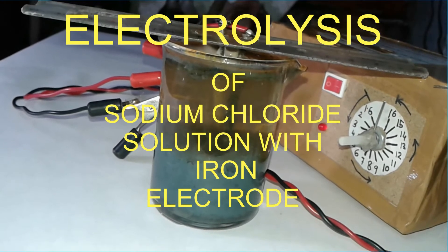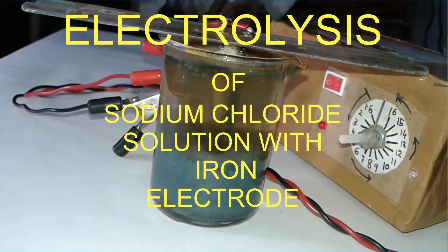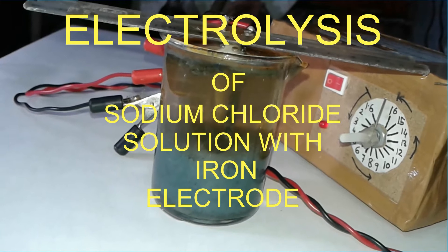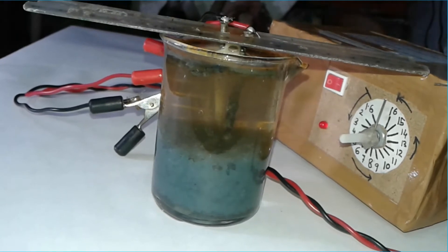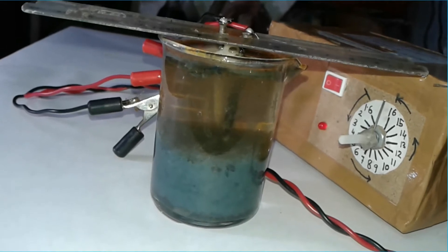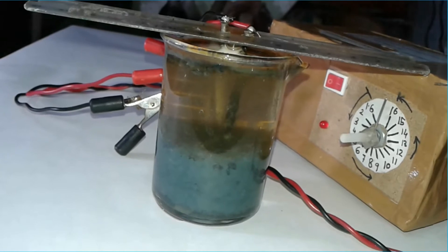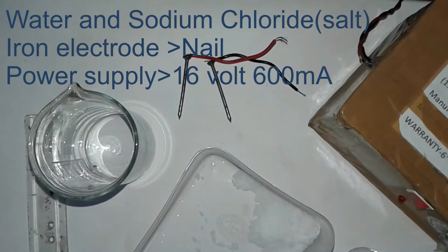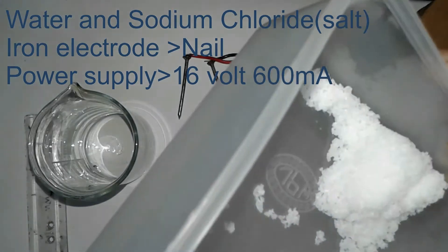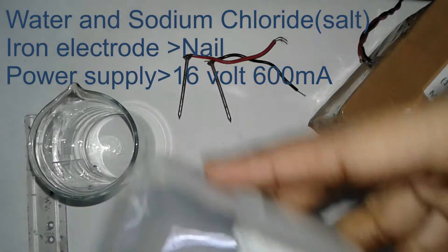Hello friends, welcome to my innovation channel. Today I will show you what happens when you electrolyze a NaCl solution with iron electrodes. Here we make a concentrated NaCl solution in water and electrolyze it with iron electrodes. I use nails for the electrodes. Let's start the electrolysis. Here we electrolyze sodium chloride, or NaCl, or salt.